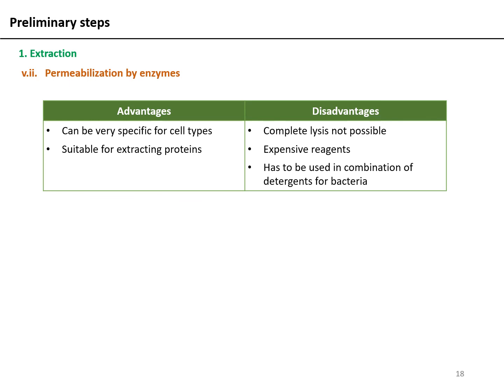Like I already said previously, the ideal method for cellular disruption has to be determined by trial and error. It is not the same for all systems, and even within a system, say for instance you purify your proteins only from bacteria, the same method of cellular lysis cannot be applied to all proteins that you're purifying from bacteria. Different proteins require different methods of cell lysis, and this will depend on the sensitivity of the protein. It depends on the protein that you're purifying, and where it is localizing within the cell will also play an effect in determining which method is more suited.